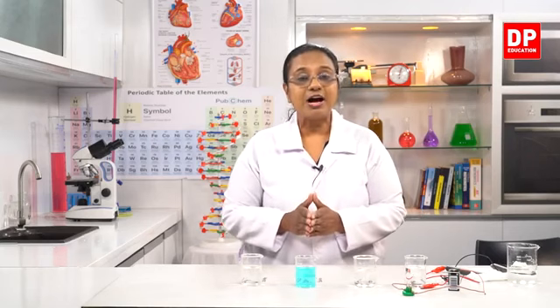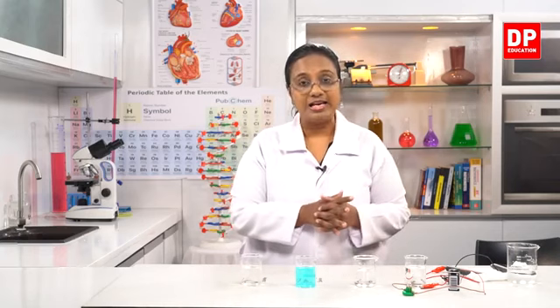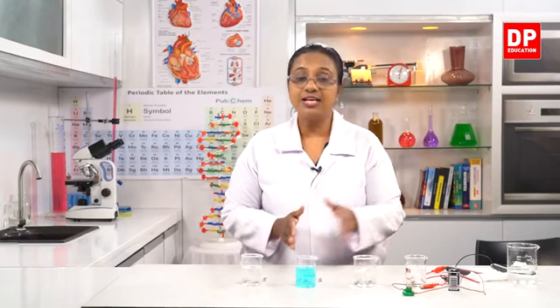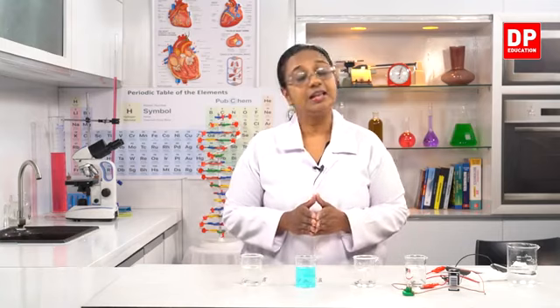So here we have understood one difference between ionic compounds and covalent compounds. Ionic compounds conduct electricity in the solution state, whereas covalent compounds do not conduct electricity in any form.